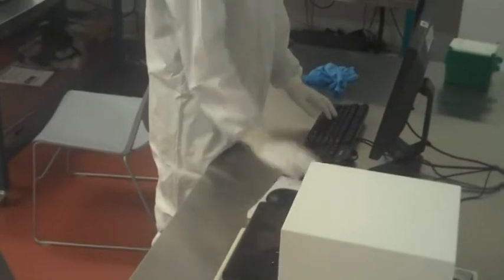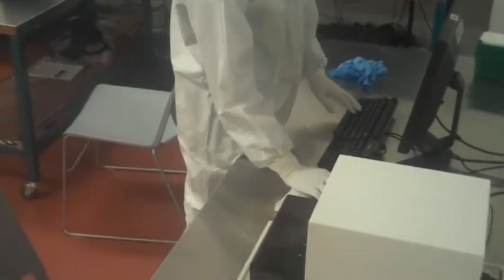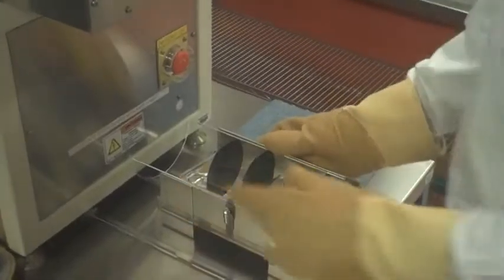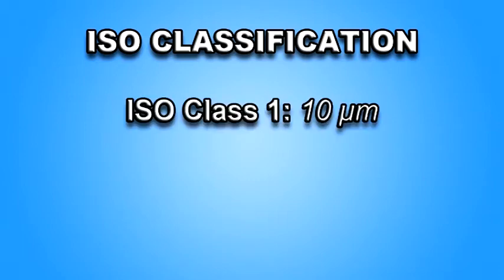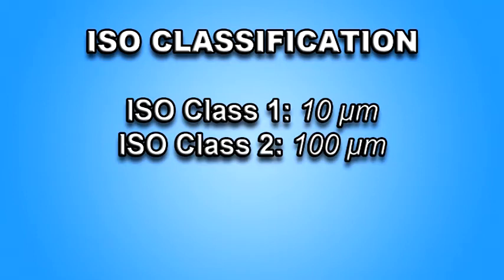Before entering the cleanroom, it's important to know the separate types of classifications that can define a cleanroom. The ISO classification system is one way in which cleanrooms can be defined. Every cleanroom is defined in ISO class based on the number of particles in the air. A cleanroom with an ISO class of 1 would be allowed only 10 micrometer-sized particles in the room at all times. An ISO class 2 would allow 100 micrometer-sized particles.